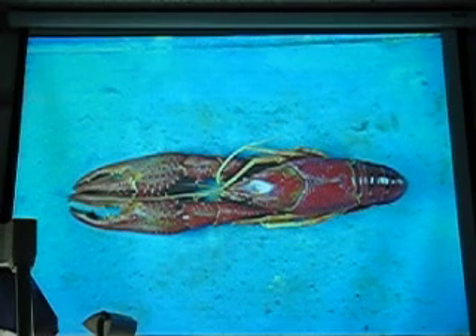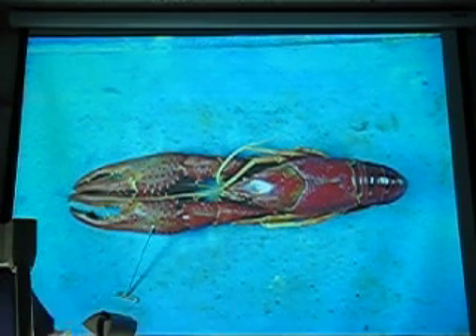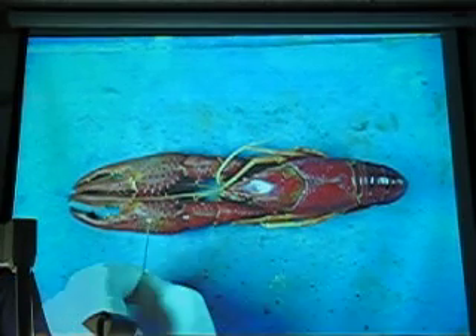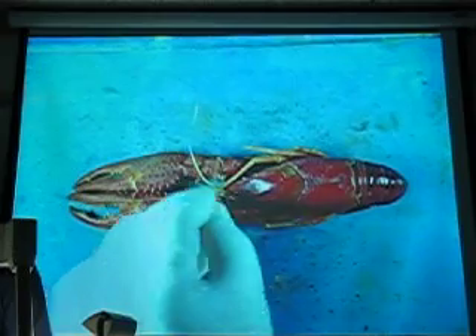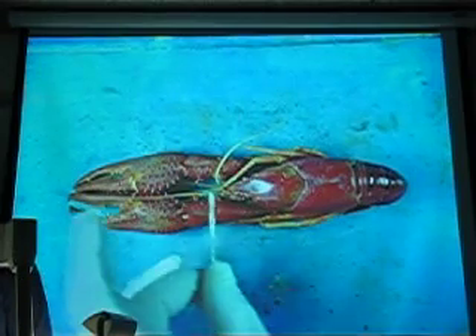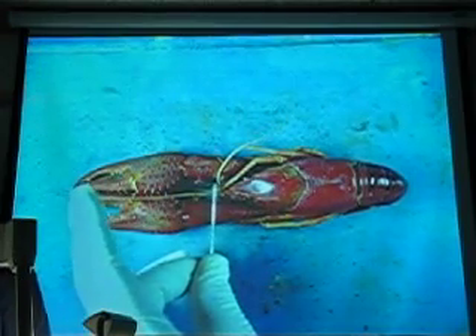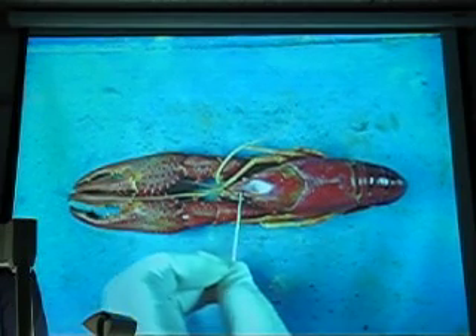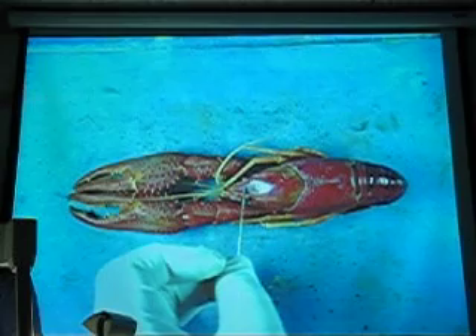Now we'll start this dissection like most other students start the dissection — not with a scalpel in the hand, but a pin. What is the structure here? Can you see that? And what's this one? Big one here. And then what are these guys right here? Tannules. Thorax. Rostrum. Rostrum.